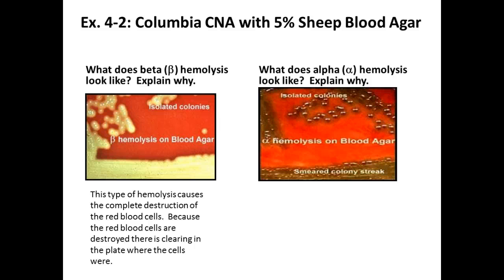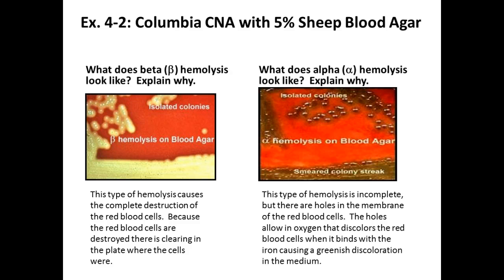As that one's going around, on your desktop, there is another red plate, right, that has like a 1 and a 0 written on it. Hold that one up to the light and compare. One side is what we call alpha, that tends to have a greenish discolorization to the lysis. So is it the 1 or the 0 that's alpha? Hold it up and see if you can figure it out. The one. I would say that. Yeah.